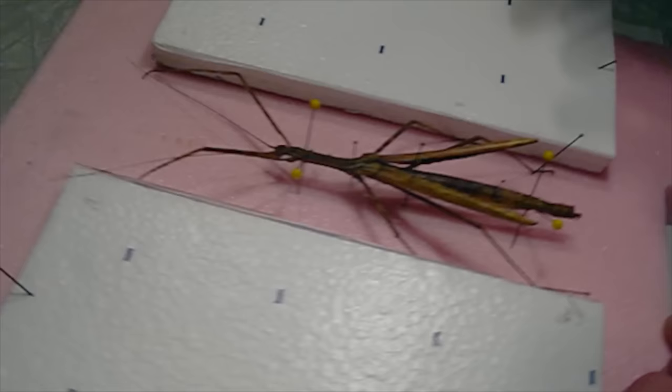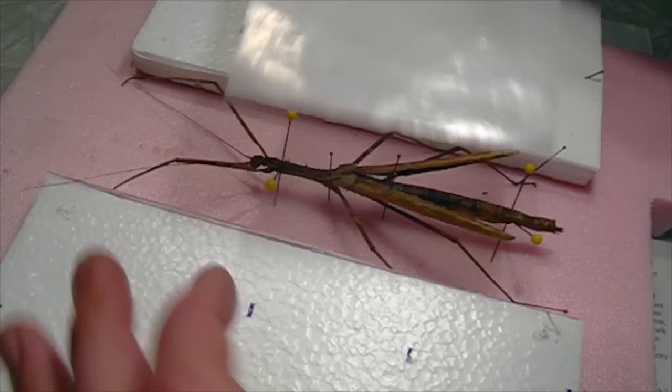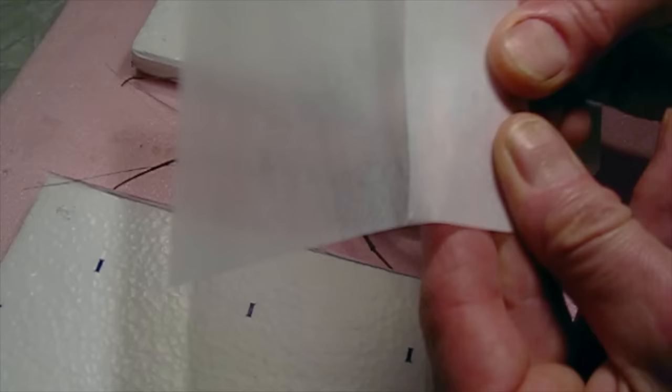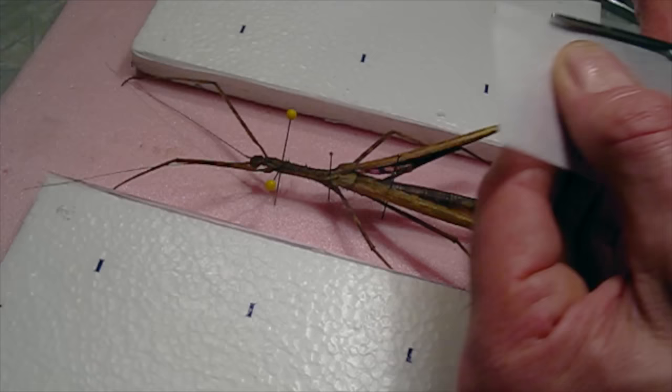Interestingly, the right leg is slightly smaller than the left leg, which suggests that when this was a small nymph the leg must have broken off and grown back — which is always pretty amazing. Now I'm going to get a sheet of glassine, which is the paper we use to hold the wings down. I need a sheet just big enough to hold the edge of the wing, so I'll fold this and cut it. It's nice to have the glassine sheets the same size, because the symmetry makes it a lot easier to see that everything is lined up properly.